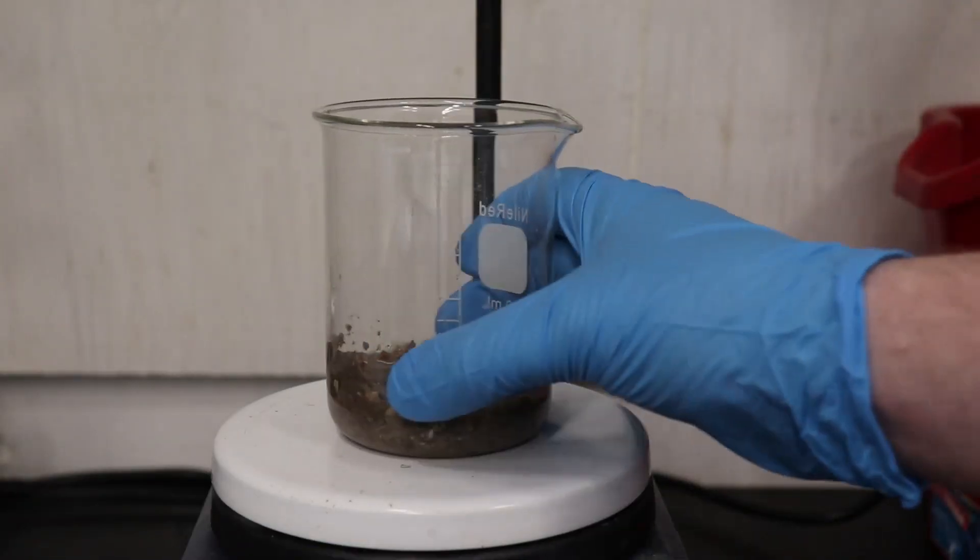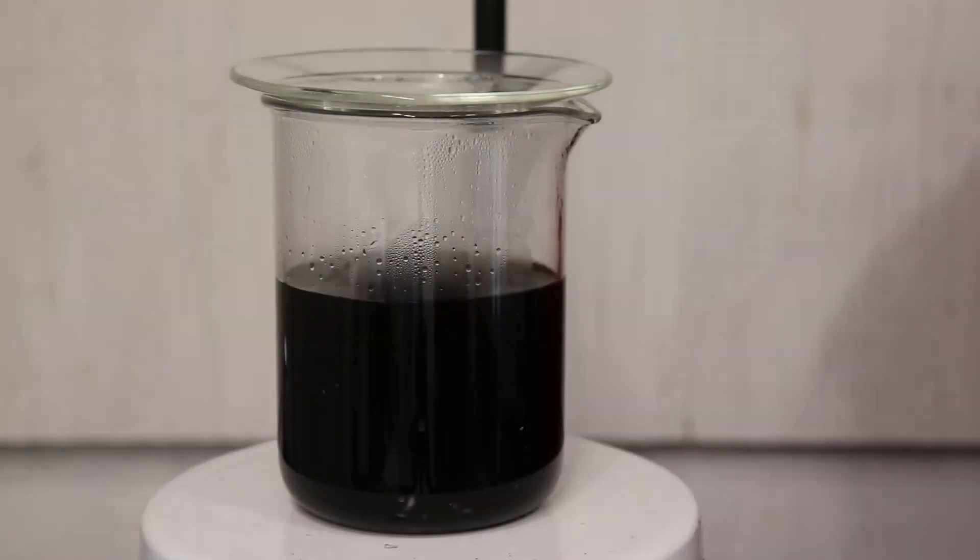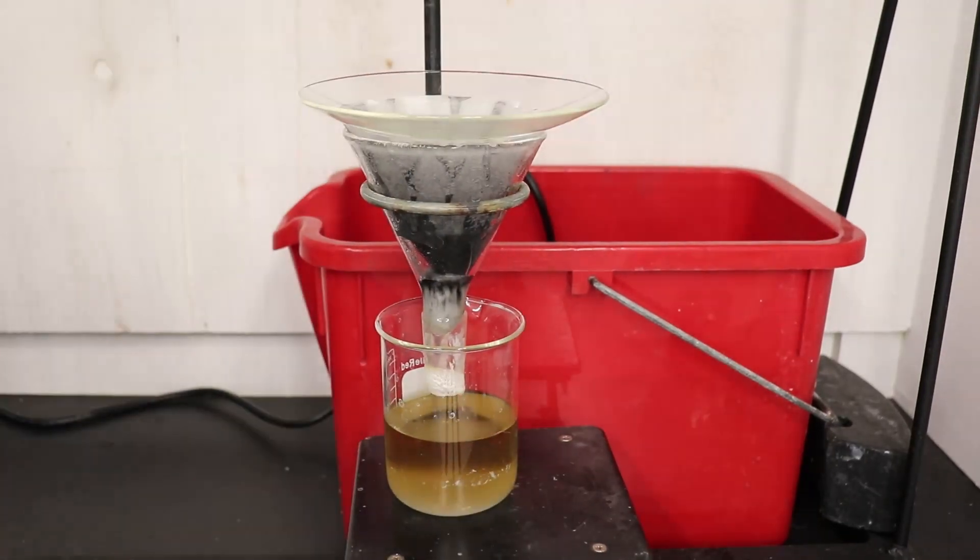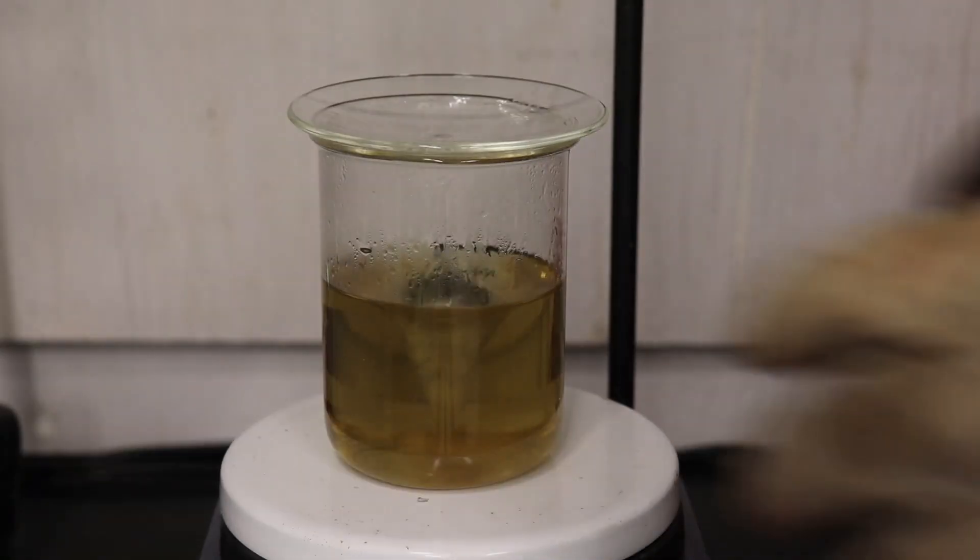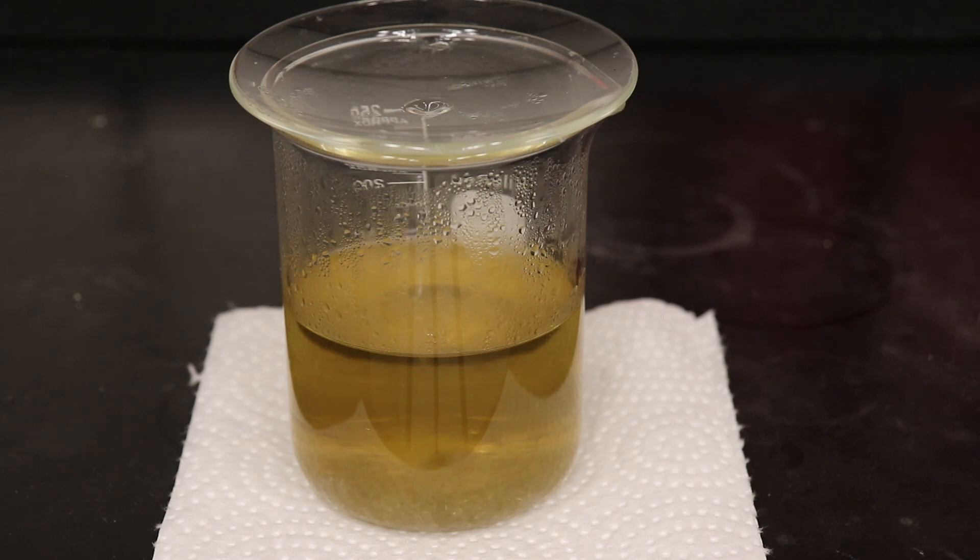I then dissolved the crude material in a minimal amount of boiling ethanol. I added some activated charcoal and then hot filtered the solution, and this time it seemed to have successfully removed the darkly colored impurities. The solution cooled down a little while filtering, so I reheated it to fully dissolve everything, and then set it aside to slowly cool and crystallize.